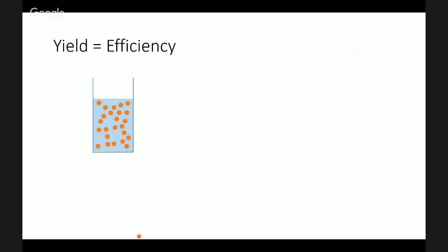One way of doing that is a liquid-liquid extraction. So we could add an organic solvent, maybe isopropyl ether, and add that to the water. It won't mix with the water because it's immiscible. But if we shake it up a little bit and force there to be a very high surface area, there's a partitioning of the iron between the two.